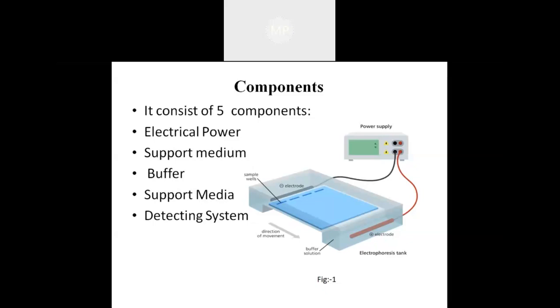This is the electrophoresis apparatus, and this is the power supply. This is the electrophoresis tank, which contains the buffer solution.